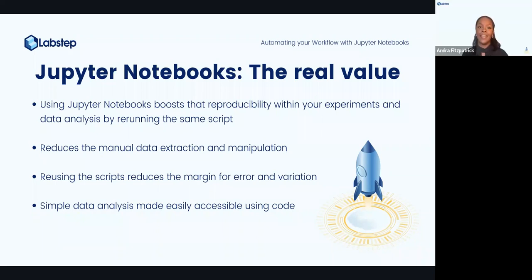Yeah, definitely. And I guess analyzing that data, just using a simple bit of code, makes it so accessible to anyone at any level in any organization. You might have interns, you'll have senior researchers, and anyone can create these data extrapolations with Jupyter Notebooks. So a very cool feature to have.